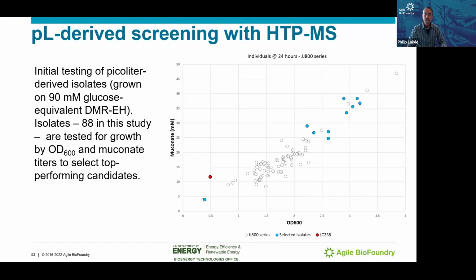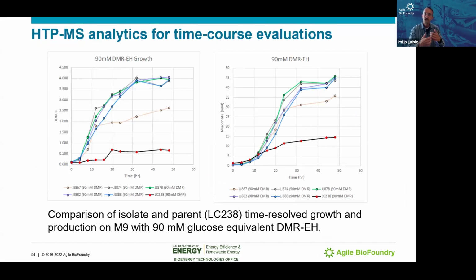So here you can see when we take our small cells and get an initial indication of how well these strains are performing, you can test the relative growth and relative production of the molecule and plot them out, and then take a subset of them and get more information about them. In this case, we're looking to see if the ones on the largest end of the scale for the best production did scale and preserve their performance enhancements that you see at small scale. And so we now, Angela, next slide, start evaluating them with more traditional approaches.